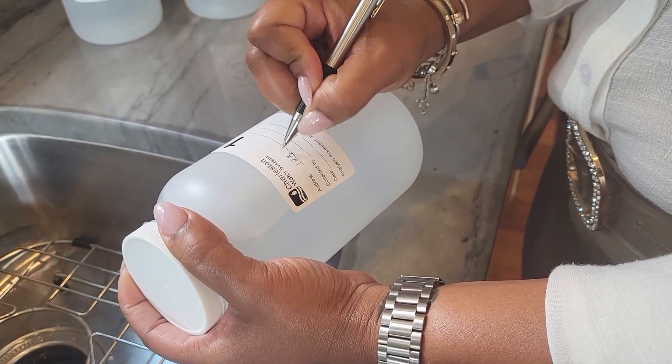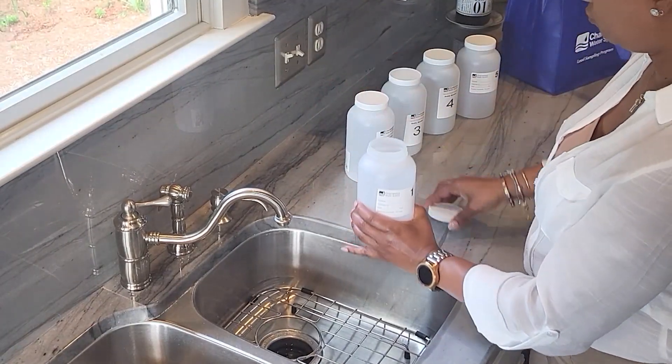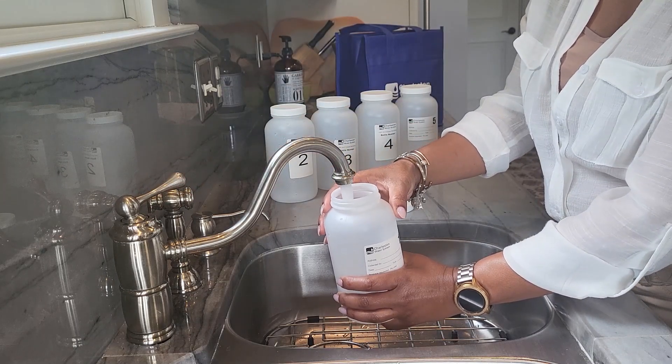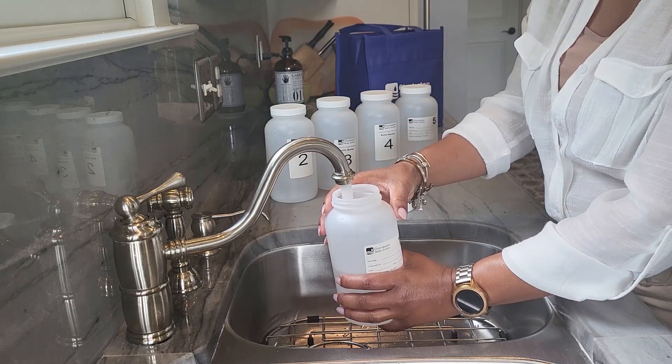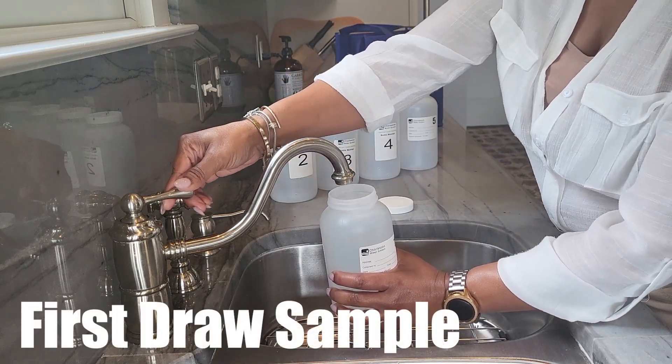Write the relevant information on bottle number one. When filling the bottle, place it under the faucet and gently open the cold water tap. Be sure to fill the 1,000 milliliter bottle to the top with the first water that comes from your cold water faucet. This is called a first draw sample.